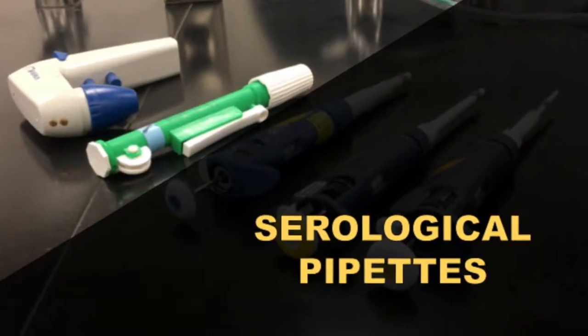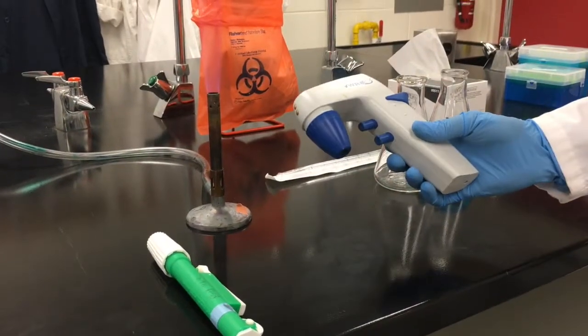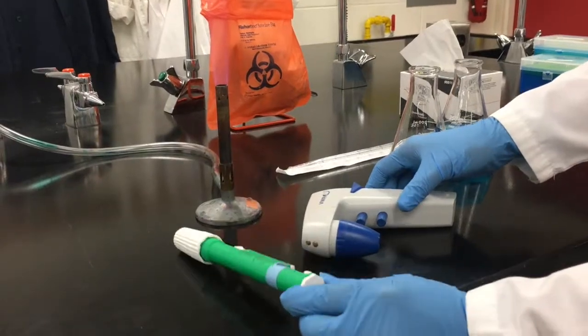The electronic and manual serological pipettes are useful when transferring larger than 5 mils of a liquid. Electronic is great for pouring accurate volumes of numerous plates. The manual is useful when only a few transfers are needed.